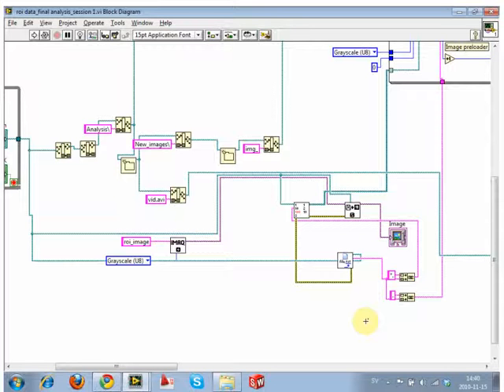You could add it on, and on the front you say... We could even write it all very explicitly and just have a little up-down button for saying which channel number. You'd choose 1, it would then make its own string, build that into the file name, and then use that. So all you would use is a little up-and-down control to choose what channel you want to look at. And that would be better than explicitly typing the filter.